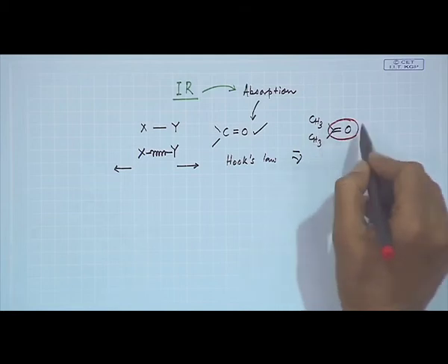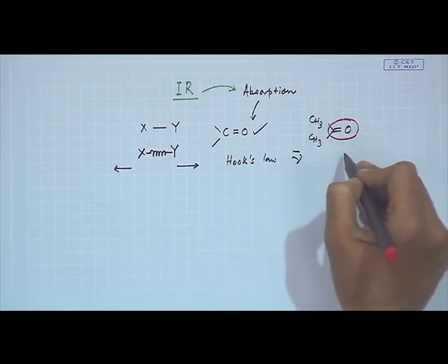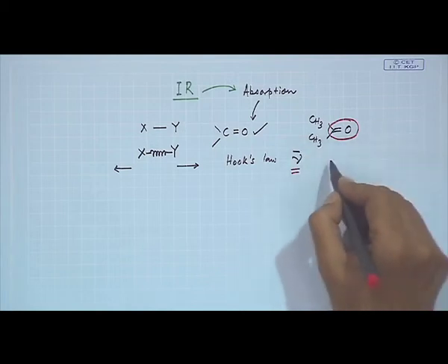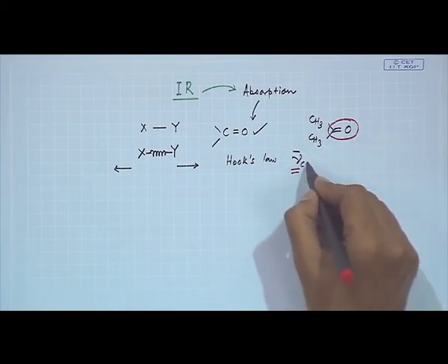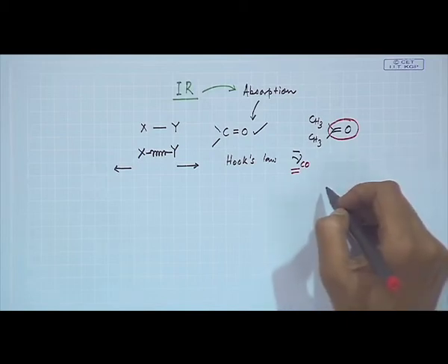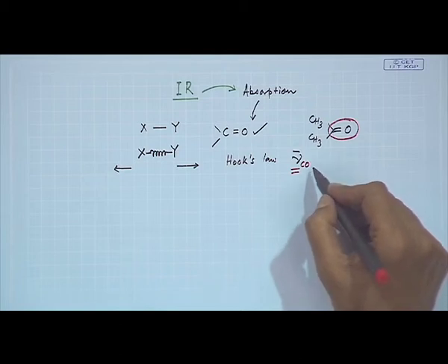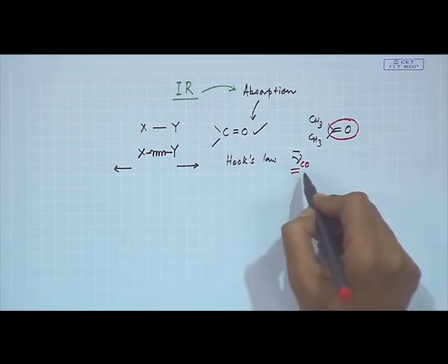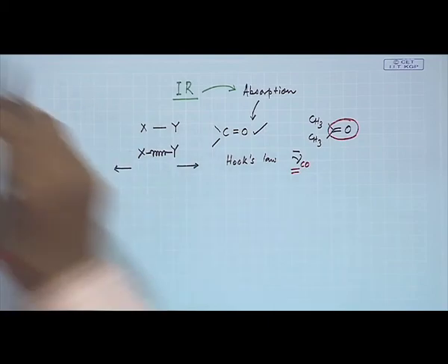So, this acetone solvent can give you the characteristic stretching frequency in terms of the absorbance values, and we call it the stretching frequency for the carbonyl function, because the carbonyl is very unique for all the different organic molecules where this particular stretching is present.